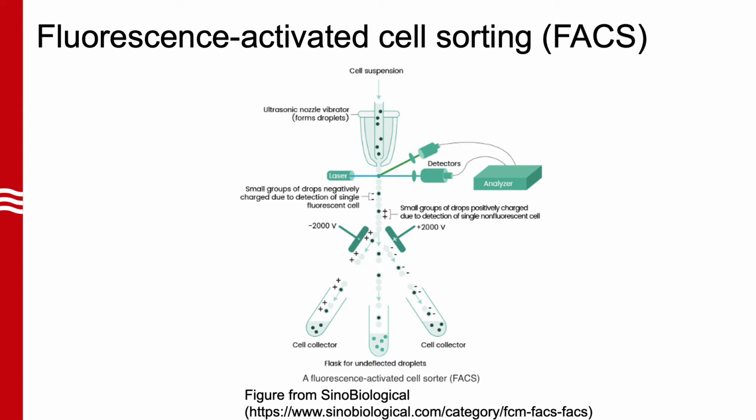So as they're run through flow cytometry, they're independently analyzed to correlate the level of soluble ACE2 binding with spike protein expression. Then through the fluorescence sorting activity, the highest and lowest binding 20% of the mutation library expressing cells were then grouped and rerun through FACS to sort into high and low binding groups and understand the difference between the two.